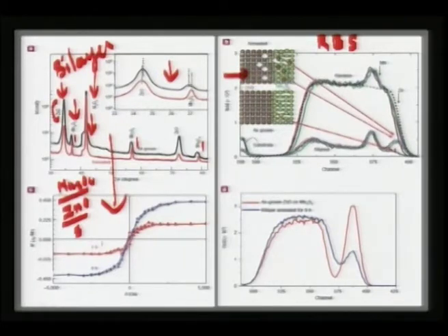So, if you take a VSM loop, you can see here that with more and more annealing temperature the ferromagnetic loop is developing. This could actually happen at the interface because of interdiffusion across the layers rather than substitution. More and more zinc seemingly is getting incorporated into the Mn3O4 lattice. As a result, you see the magnetic moment picking up.